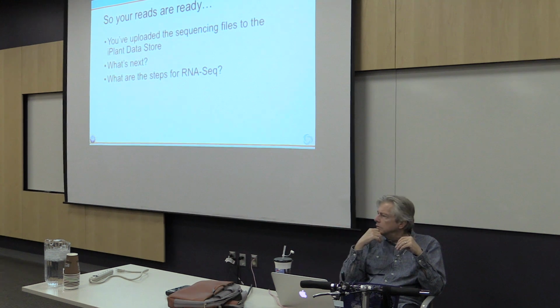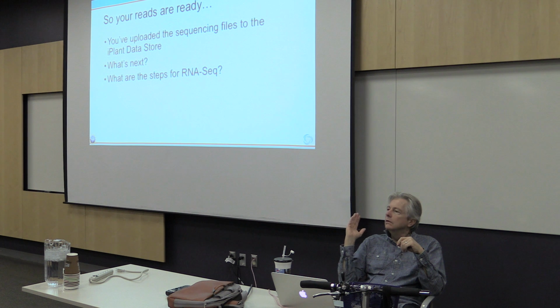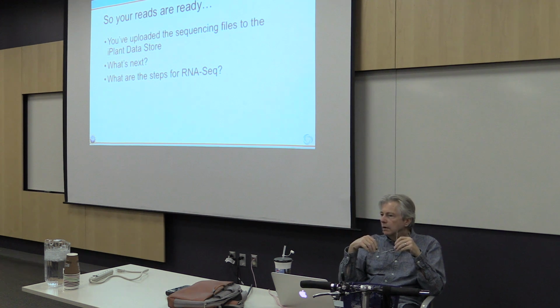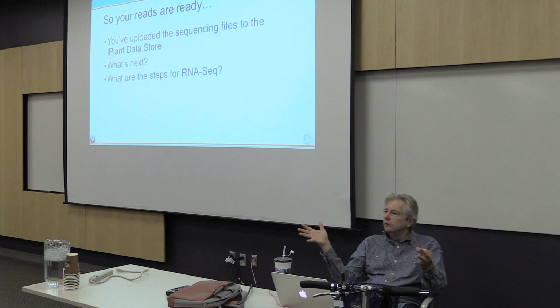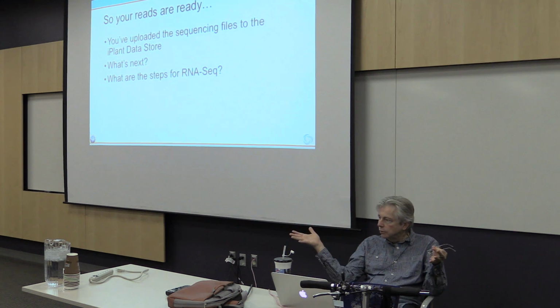I assume that you guys have already done that. That's pretty easy. And maybe you've put some of your data in the data store. But that's where your data will need to be in order to use iPlant resources. And I think also what has been described are ways of putting your data into the data store, and if you need to pull a file out in the end, to pull it down to your desktop or wherever. So the assumption is that you're working with data within the data store.